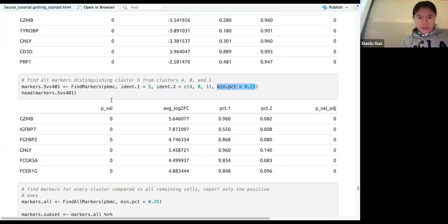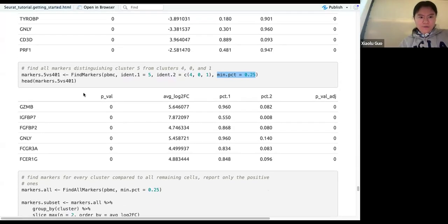I believe that if you check this object or data frame and display it to some digits, you may see non-zero values. Here, I think it's because the machine cannot detect such small values, so it shows 0.